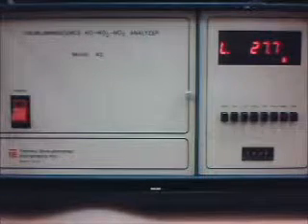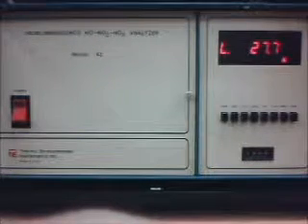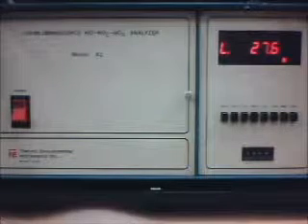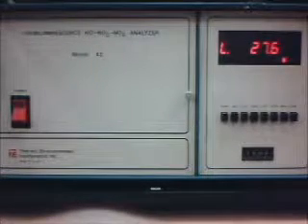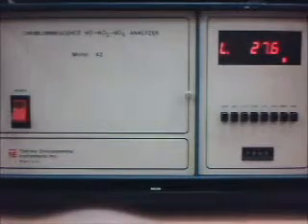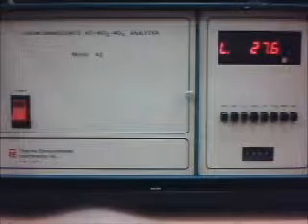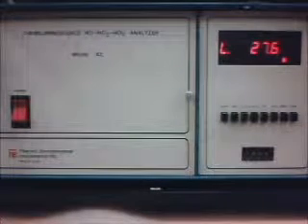You can also send nitrogen dioxide through. The nitrogen dioxide reacts with molybdenum. This reaction then produces NO and molybdenum oxide, if I'm not mistaken. And from the original NO reading, or original calibration of NO, it'll be able to tell how much NO2 is in the sample that you're sending through.